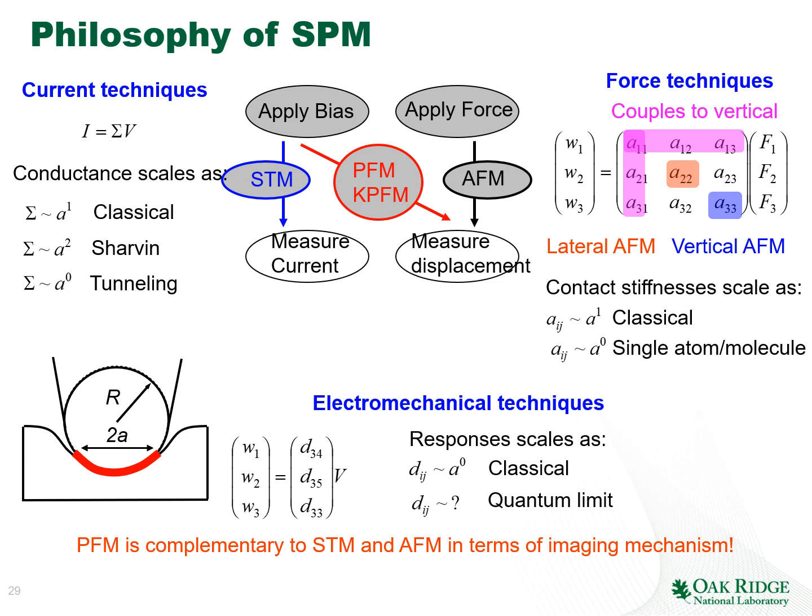In AFM, this is generally impossible, and therefore the universal perception is that AFM is not a quantitative technique, and generally it is correct. It becomes quantitative, however, once we go to the single atom or molecule level. So once we do something like molecular unfolding spectroscopy, when the cross-section is one molecule, then our signal does not depend on the contact radius, and it is quantitative.